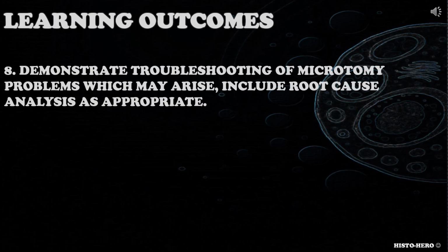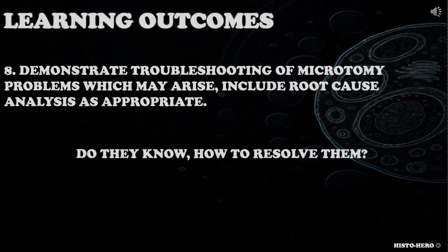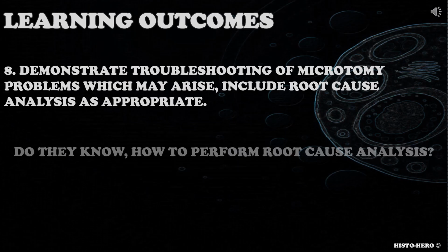The eighth learning outcome is, demonstrate troubleshooting of microtomy problems which may arise, include root cause analysis as appropriate. Candidate needs to troubleshoot microtomy problems. Does the candidate know what are the common problems associated with microtomy? Do they know how to resolve them? Do they know how to perform root cause analysis?